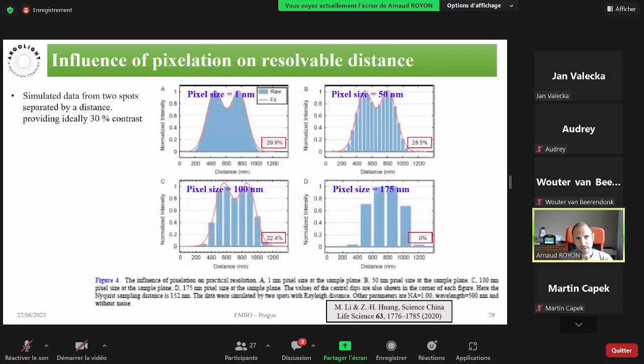Now the resolvable distance. They simulated 2 point-like objects separated by a distance equivalent to 30% of contrast, and they changed the pixel size from 1 nanometer to 50, 100, up to 175 nanometers. Here you can see that the 2 points of the profile can clearly be discriminated, while for a high pixel size, it's no longer the case. So the contrast decreases as the pixel size increases.